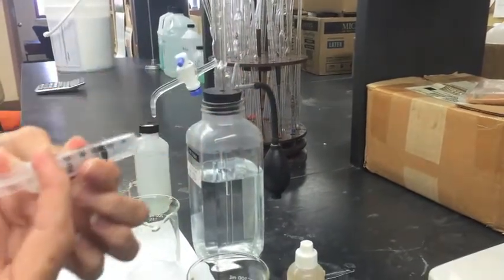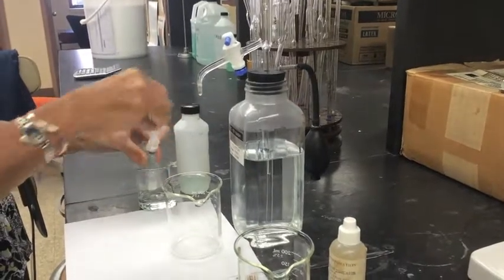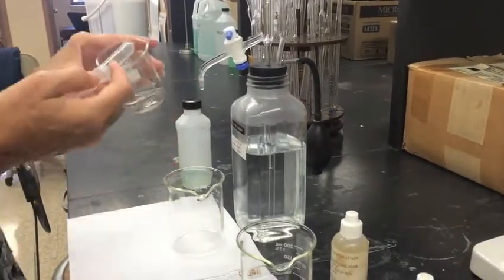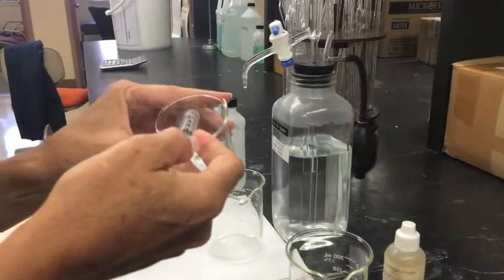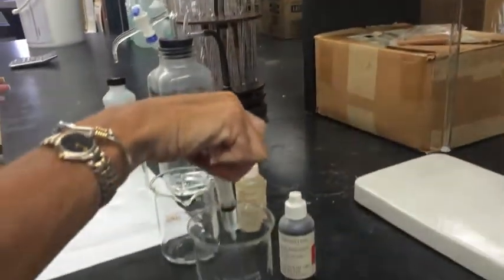This is exactly 5 mils. So let's fill up with the 5 mil syringe. We're going to make sure there's no bubbles. We're going to make sure that it's filled to the 5 mil mark. And we're going to place that into a clean beaker.